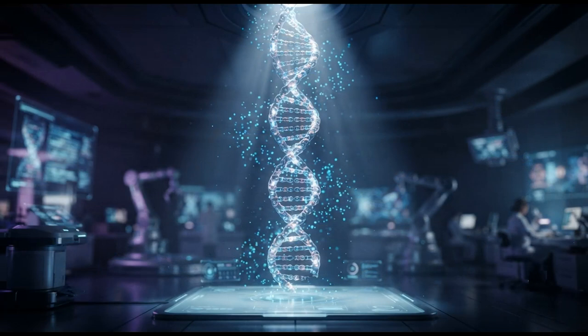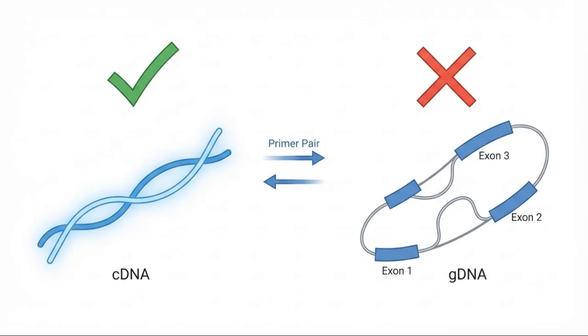If you forget everything else from this video, remember this one sentence: design your assay to amplify cDNA, not genomic DNA. Everything else is secondary.